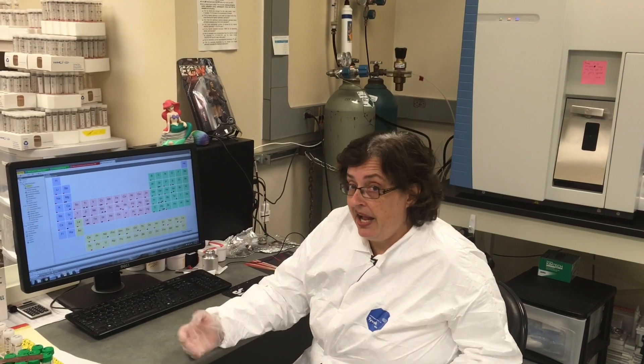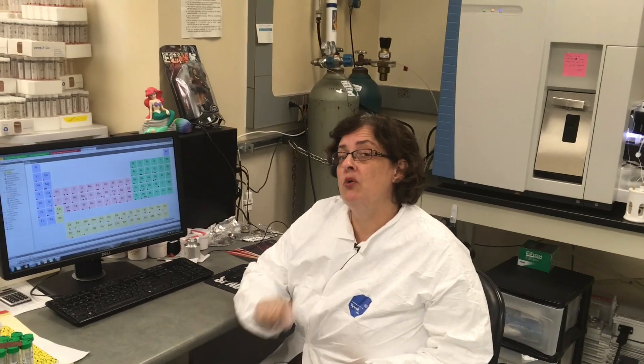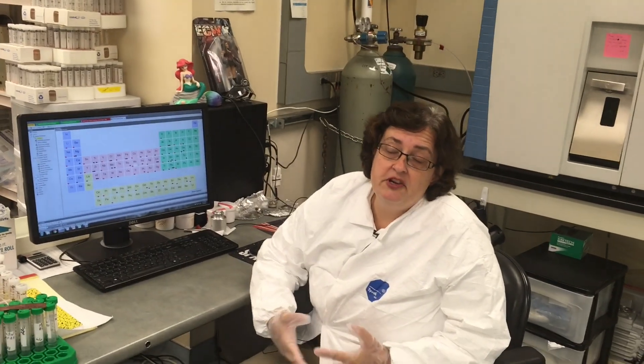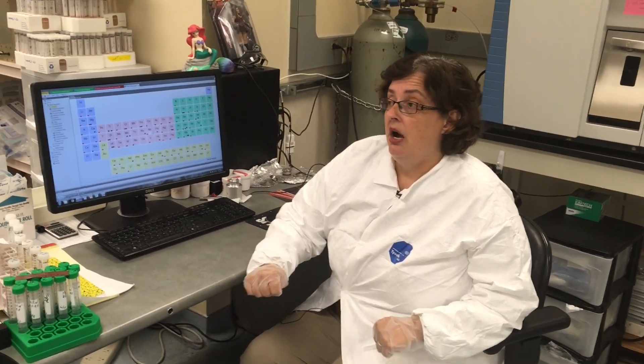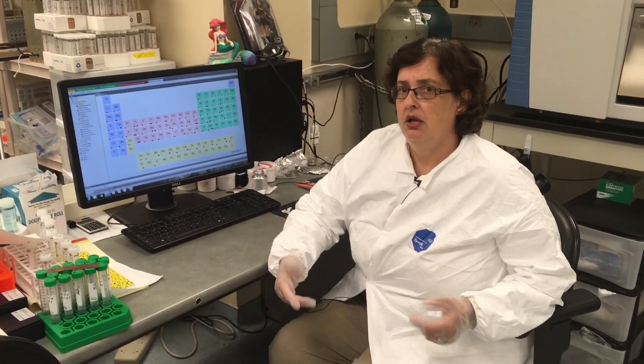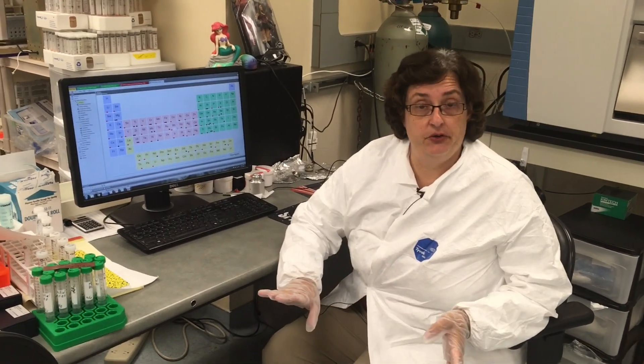Just because we can measure everything doesn't mean we can measure everything well in your samples. It requires an understanding of the chemistry of your samples. For instance, gold is not very stable in solution — it tends to drop out, so it requires very special precautions. There are a lot of interferences, and we know about many of them, but not all. We also have different relative sensitivities; for instance, we're not measuring silica very well because there are some gas interferences.